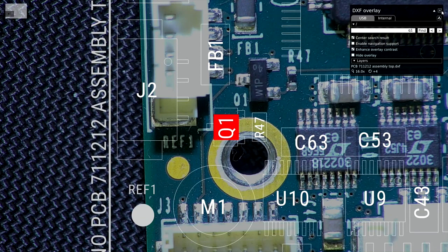And that's something that TAGARNO is actually very good about. They work closely with their customers, and if you need an app to do something specific on a microscope, or if you need maybe a change to an app, then obviously we can run it by the R&D staff there and see what can be done.